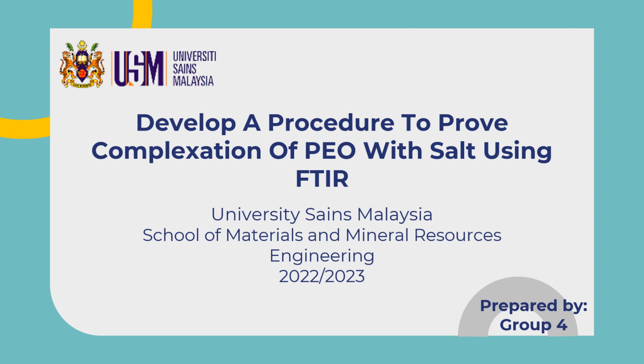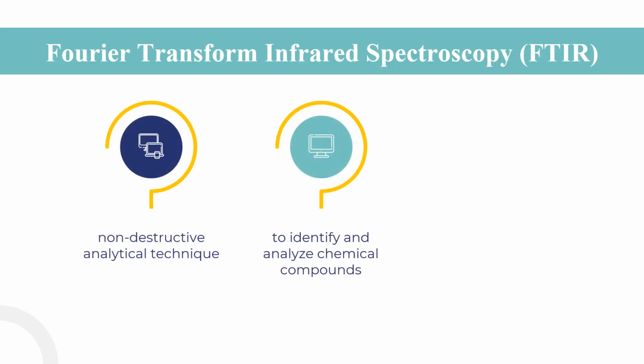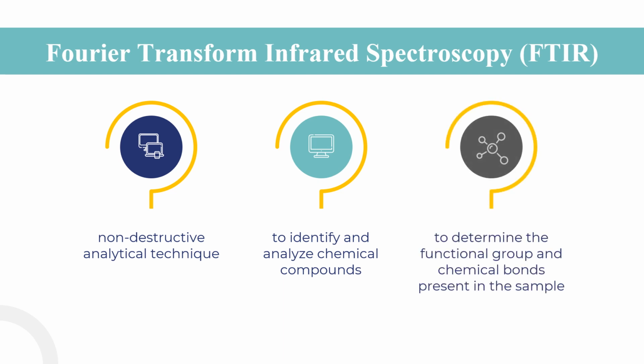Develop a procedure to prove complexation of PEO with salt using FTIR. FTIR is a non-destructive analytical technique used to identify and analyze chemical compounds. FTIR measures a sample's infrared absorbance or transmittance at various wavelengths to determine the functional groups and chemical bonds present in the sample.